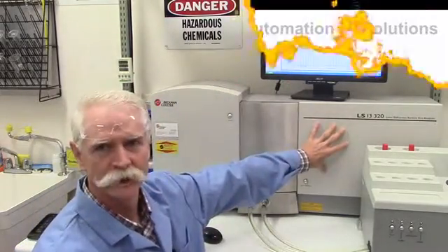This system consists of three major components. It consists of the optical bench, which is the large instrument here.